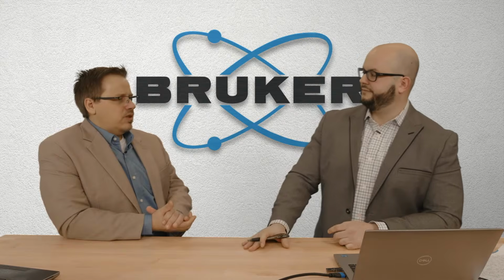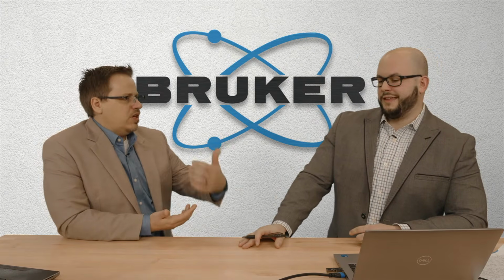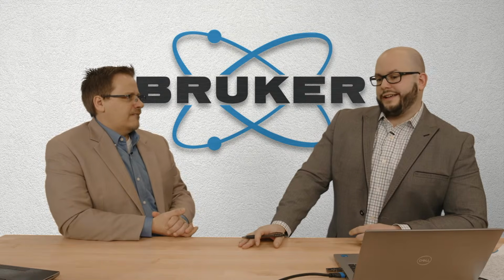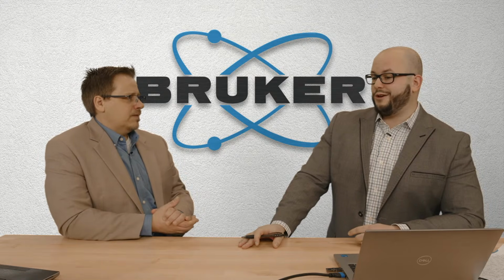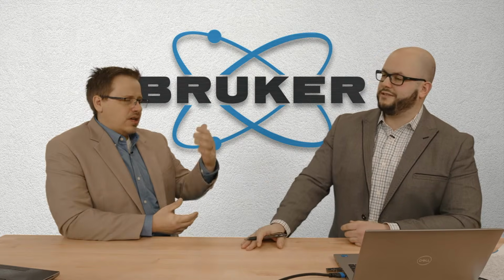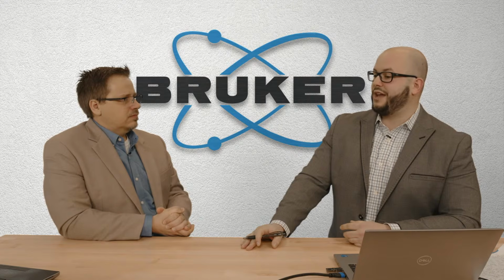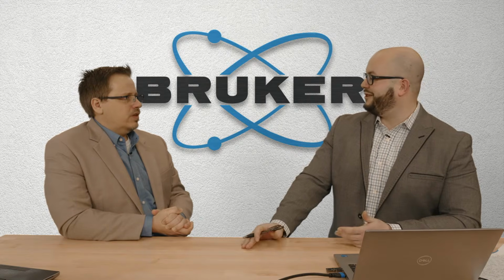And that's going to be the high angle. So you have kind of a rule of thumb that you go by? Like I want to have a peak over... Well, I would typically go for the highest order reflections, or highest angle reflections, that I can. That's normally what I would do. But again, you have to use what you have available also, right?